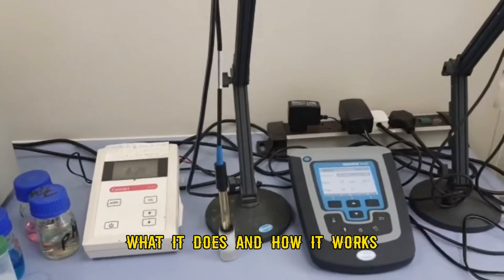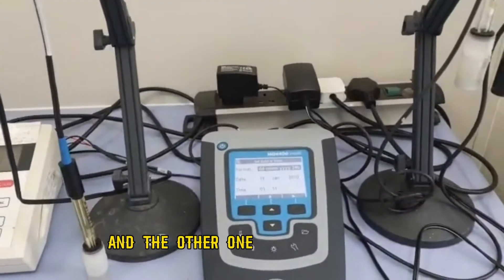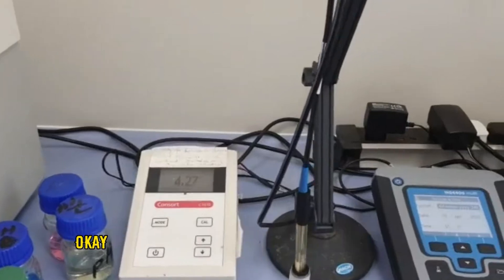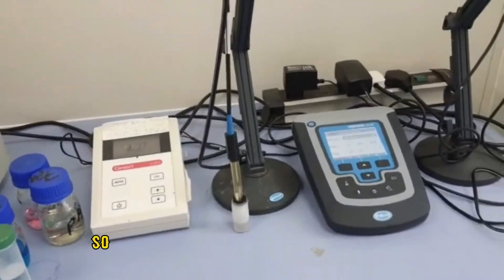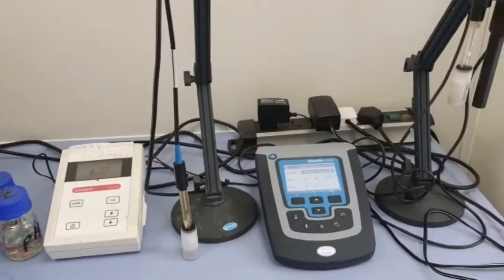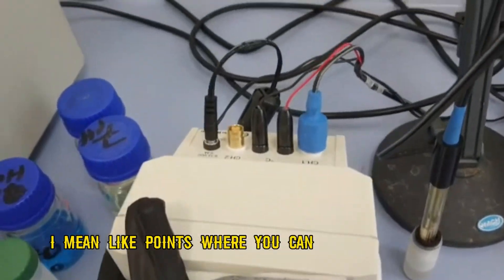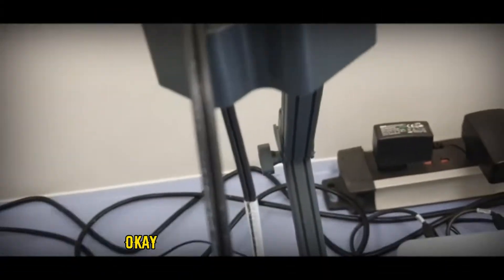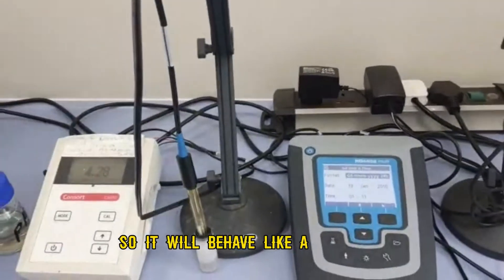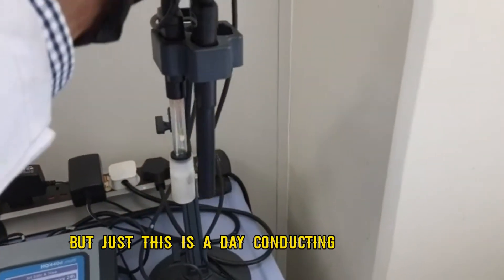We have two different kinds of pH meters here. One is called Consort and the other is from Hach. The first one is just a pH meter, but it can also behave like a multimeter — as a conductivity meter, a DO meter, as well as a pH meter. At the back there are points where you can change the probe. If you put a pH probe it works as a pH meter, or if you change to a conductivity meter probe it functions accordingly.